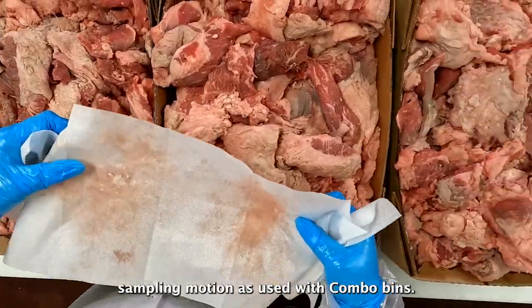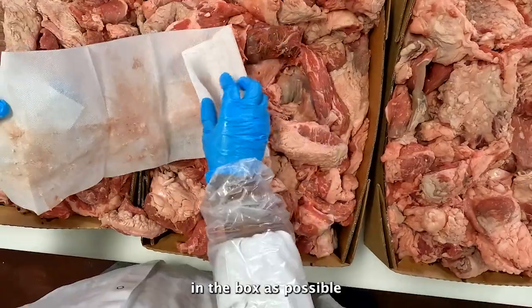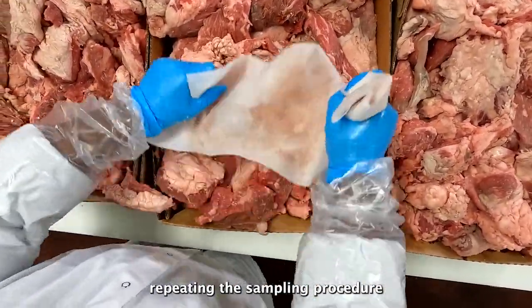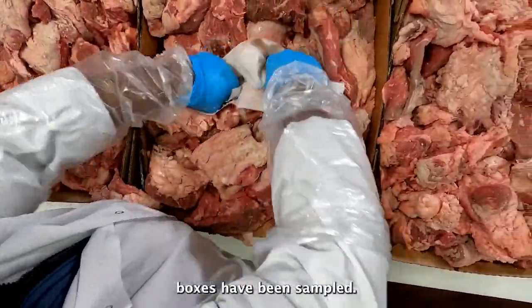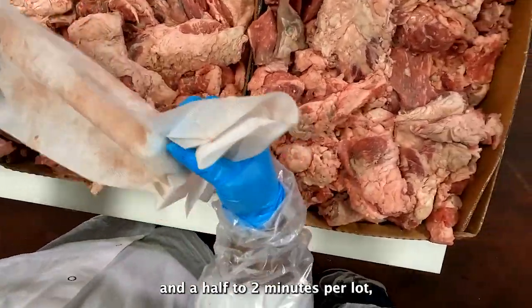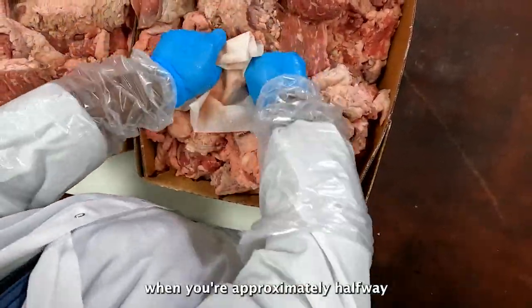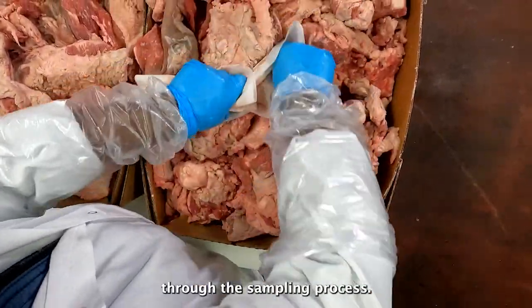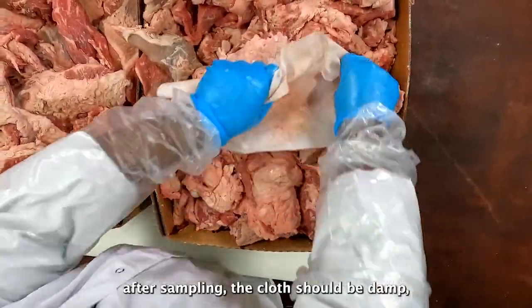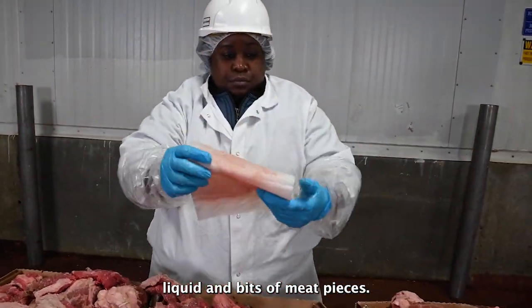Use the same vigorous sampling motion as used with combo bins. Make sure to contact as much product in the box as possible, then move to the next box, repeating the sampling procedure until all selected boxes have been sampled. Sample for a total of one and a half to two minutes per lot, dividing your time equally per box. Flip the cloth over when you are approximately halfway through the sampling process. Whether you sampled a combo or boxes, after sampling, the cloth should be damp, should have a darkened appearance, and should have picked up liquid and bits of meat pieces.